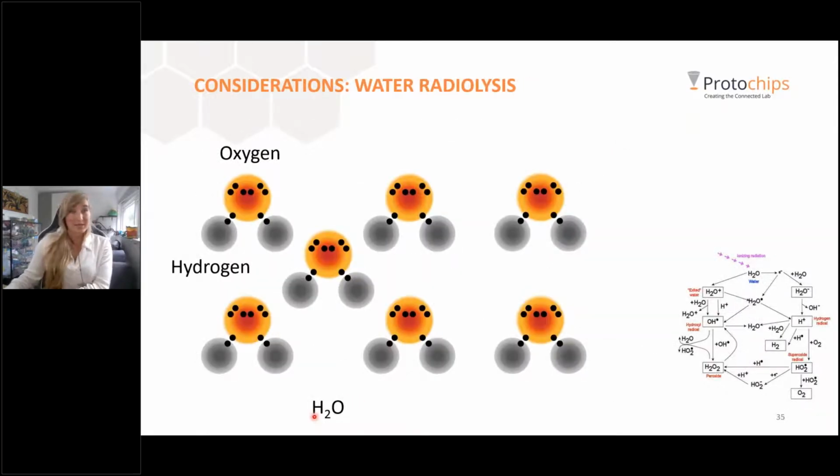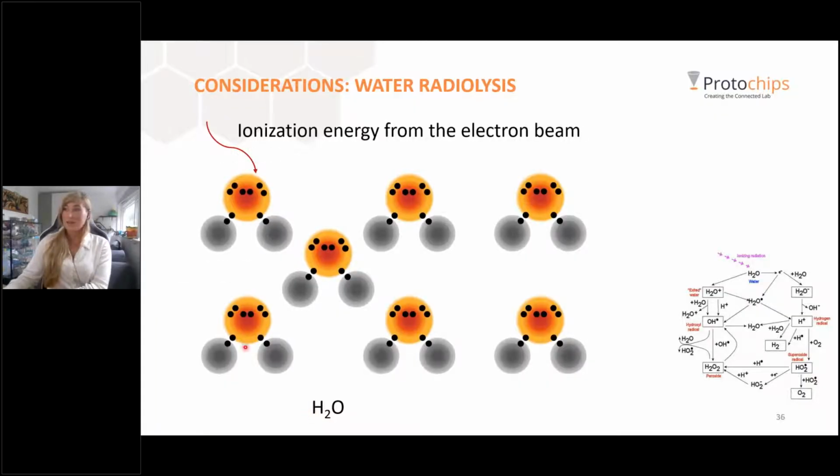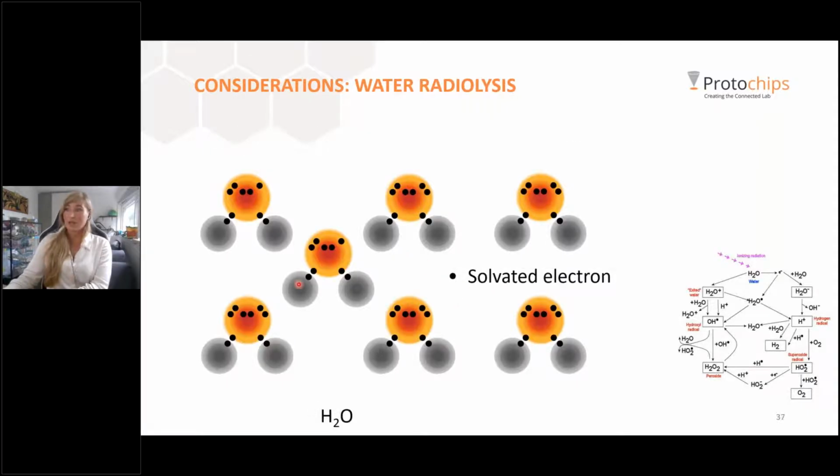So what happens exactly when you add your ionization beam to your water? These are all the water molecules. You can see over here they have their own electrons. And if a beam hits an electron, it can push out different electrons from your water molecules. This will cause solvated electrons to form.